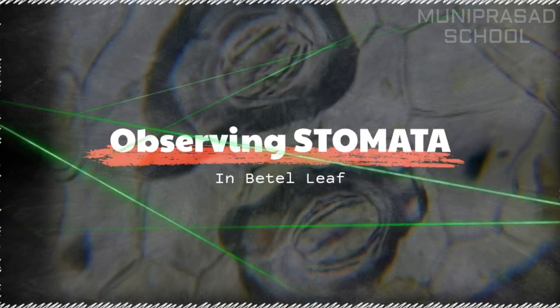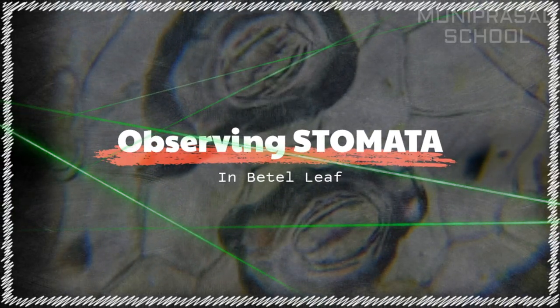Hi to all. Today we shall see how to observe stomata in betel leaf.